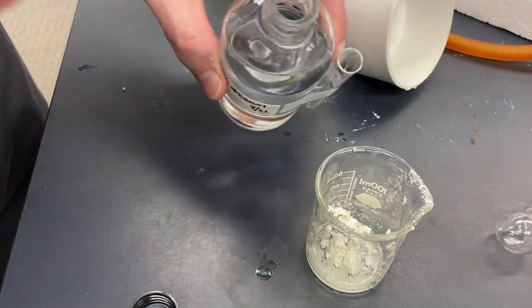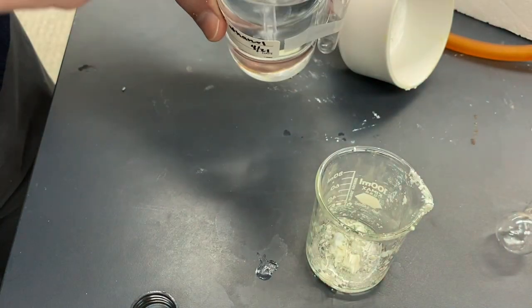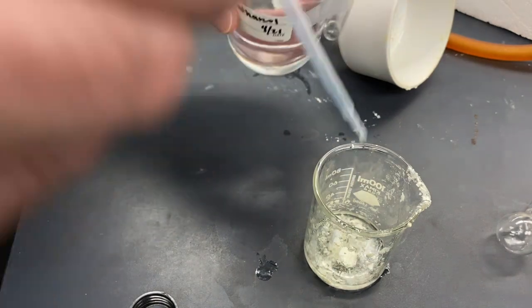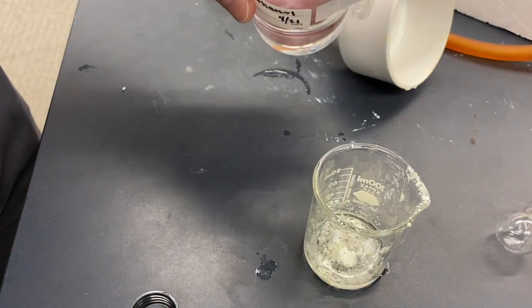Because if we did, then we would have added too much. And sometimes I'll use this to kind of rinse down the sides. I'm going to try adding maybe about 5 milliliters, somewhere around there.